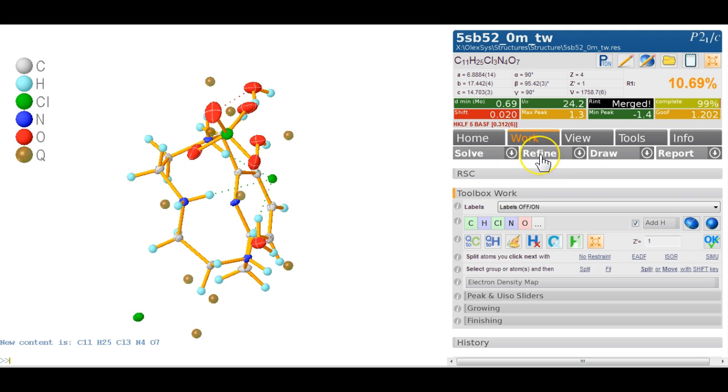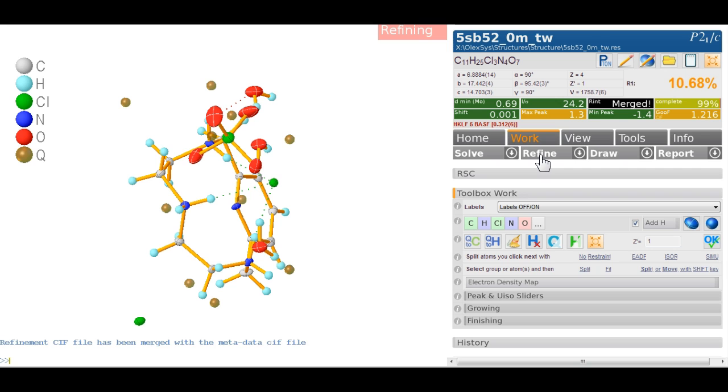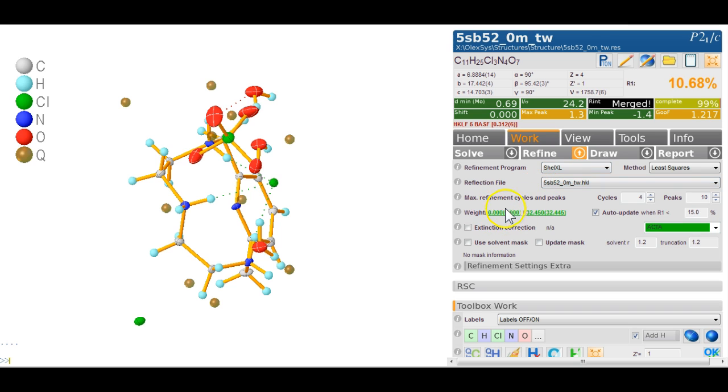If I refine this again, then we are looking good. R factor is about 11%. Nothing moves, nothing shifts. Let's have a quick look at here. The weighting scheme is settled. Let's just have a look at the extinction. This is of course not going to really work with twin data, but let's have a look with it. It makes no difference. It's 17 with an ESD of 17, so that's meaningless. We get rid of that again.